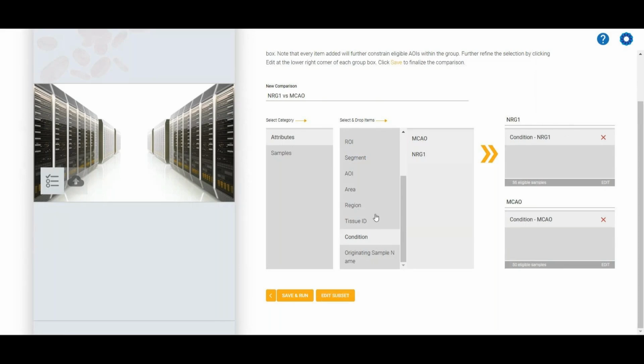You can also drag and drop those yourself as well. We can drag and drop core here and do that. This is an easy way to set up your data. And you can do this and compare different regions as well.